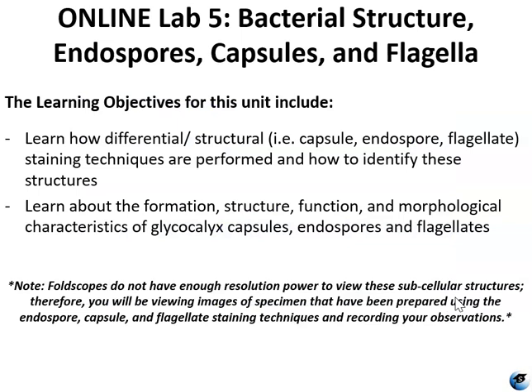The learning objectives for this unit include learning how differential and structural staining techniques are performed in order to identify endospores, capsules, and flagella. We will learn about the formation, structure, function, and morphological characteristics of these sub- and extracellular structures.